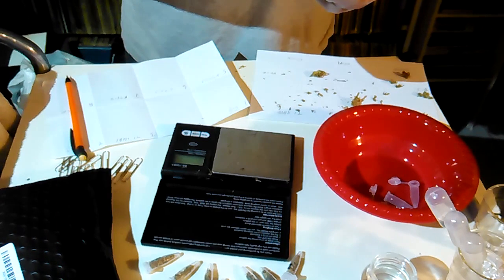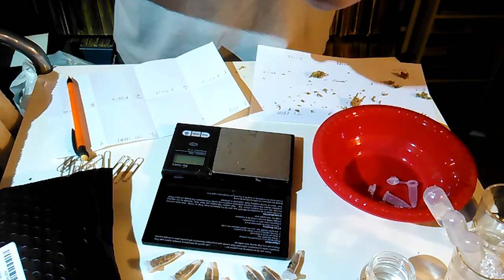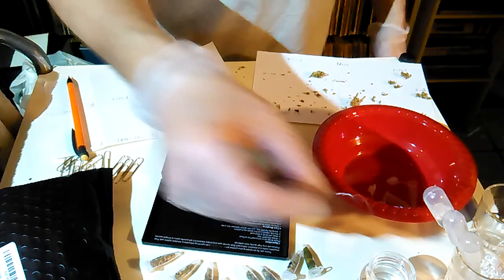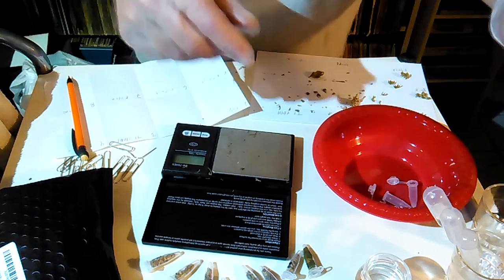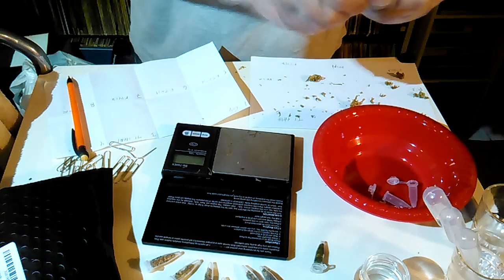So then this paper clip also, if you're going to be careful about anything, this is contamination. So now this paper clip has some, whatever, maybe CBD. I'm going to rinse it in this other one here. And I could throw it out, but whatever. I'm going to use it for a couple. So now number 2.